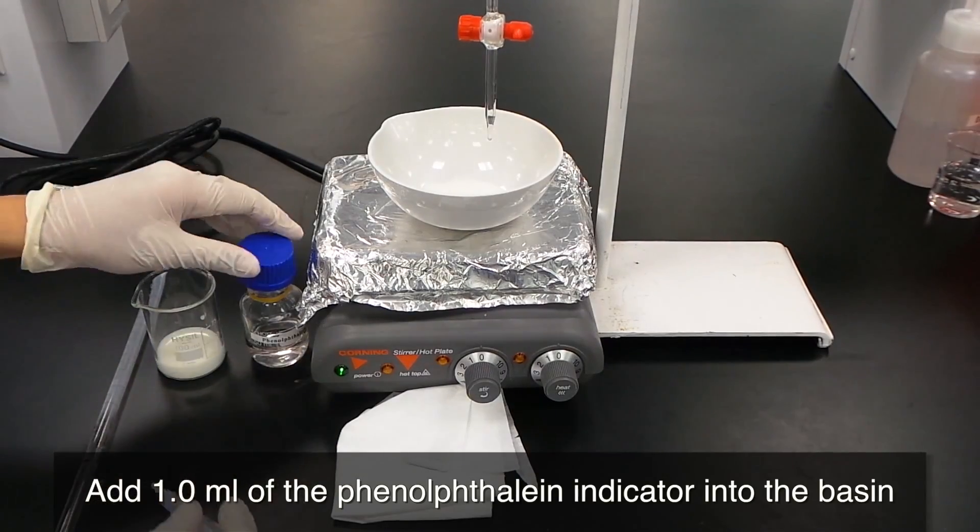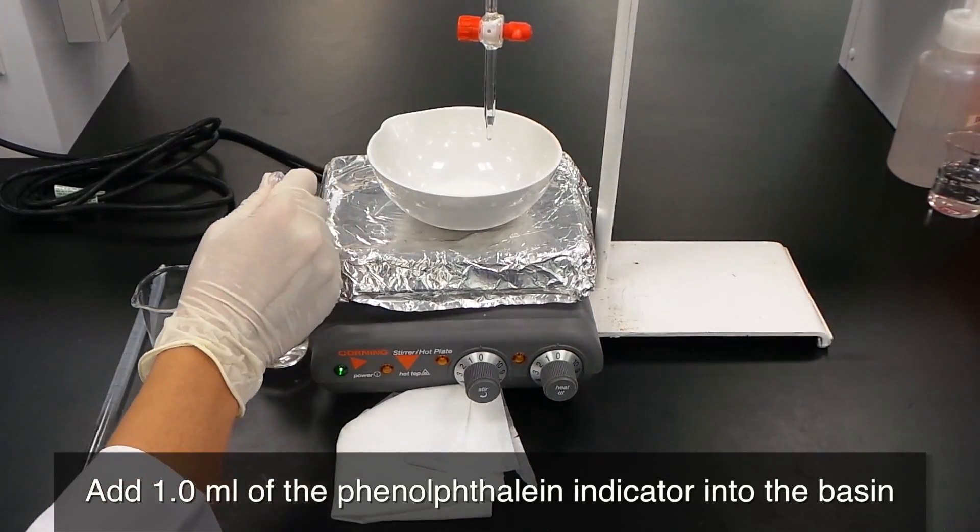Add 1 ml of the phenolphthalein indicator into the basin.